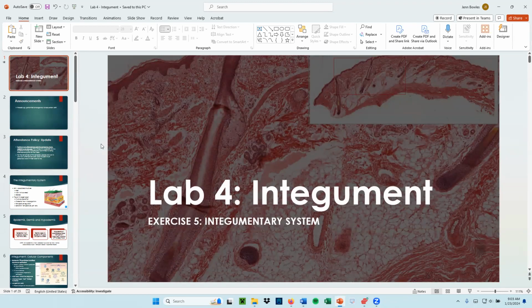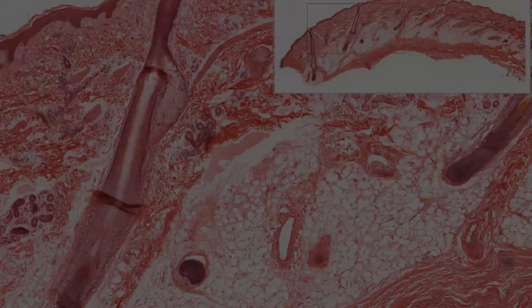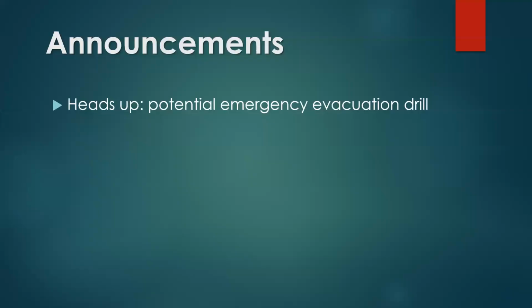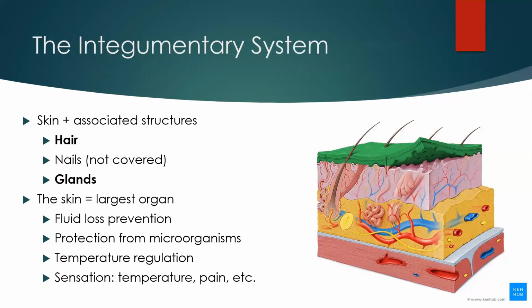Okay. So today we're covering the skin system, sometimes known as the integumentary system. So make sure you're keeping up with this stuff in your lab manual. It is pretty histology focused, so that's why we're using the virtual microscopes. And then next time we'll have plenty of time for you to review this in class and work with the microscopes yourselves, so we will not be too far behind.